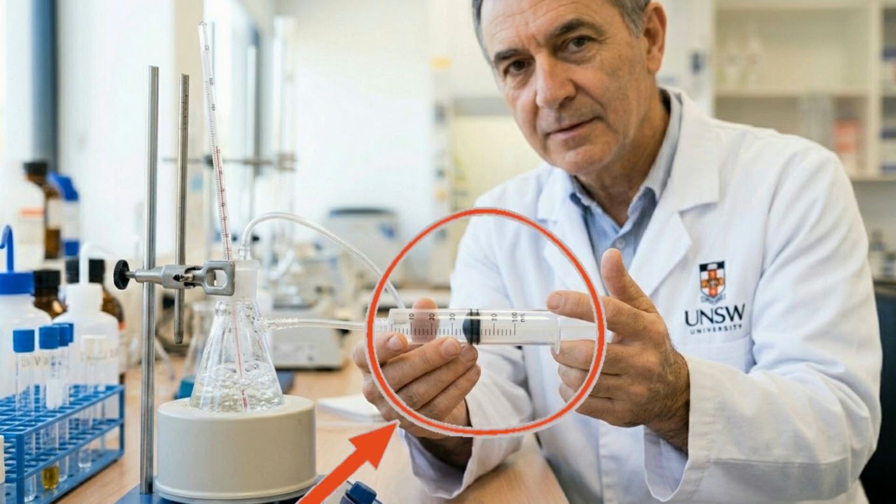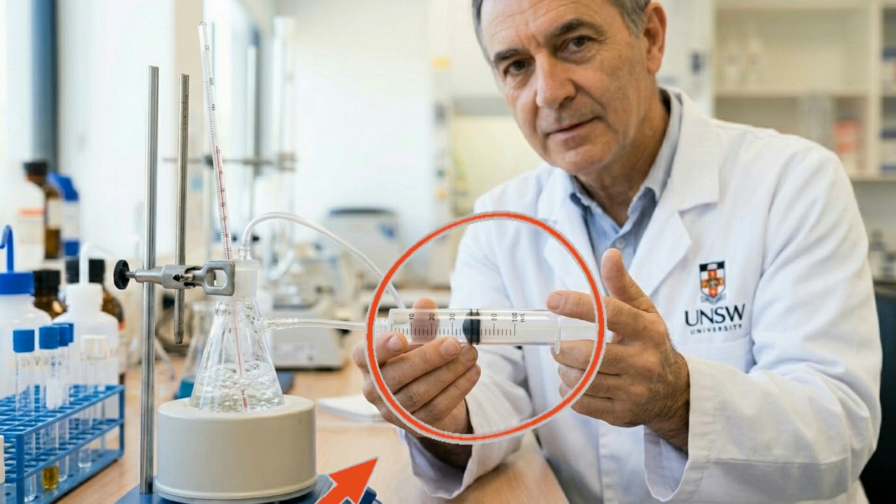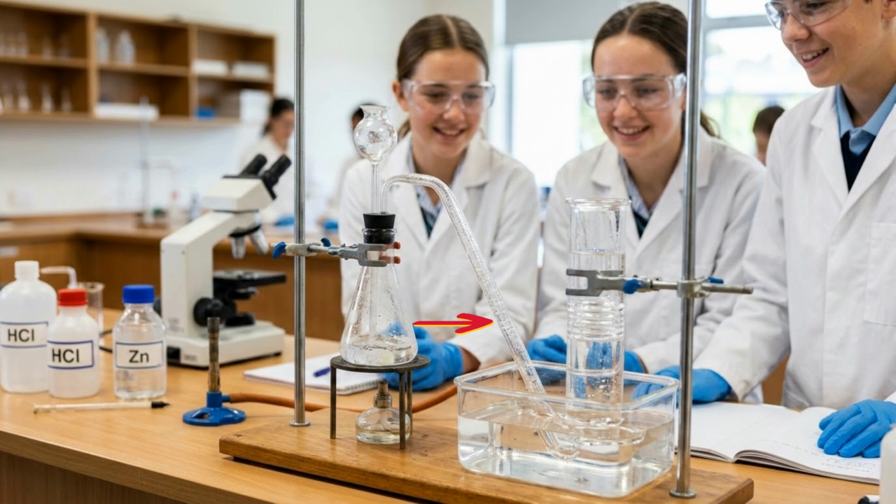This is a gas syringe. It is a special type of syringe, often larger and made of glass, which is used to measure the volume of gases produced during chemical reactions. A thin glass or plastic tube used to transfer liquids or gases from one container to another is called a delivery tube. It is often seen as part of the setup for gas collection.